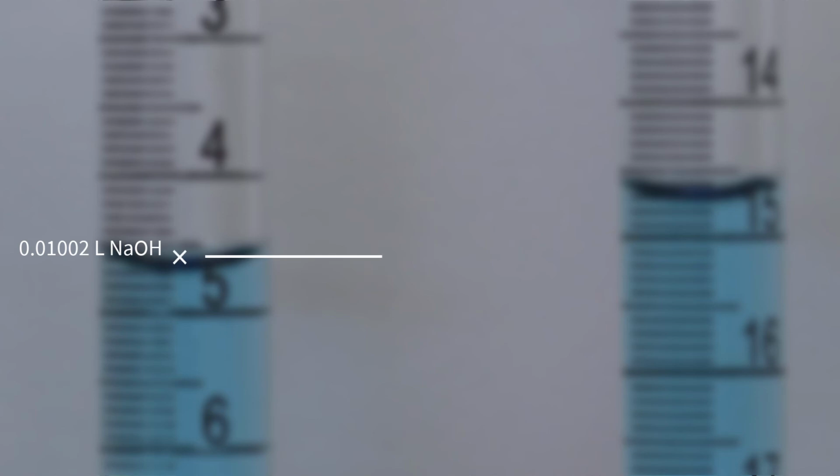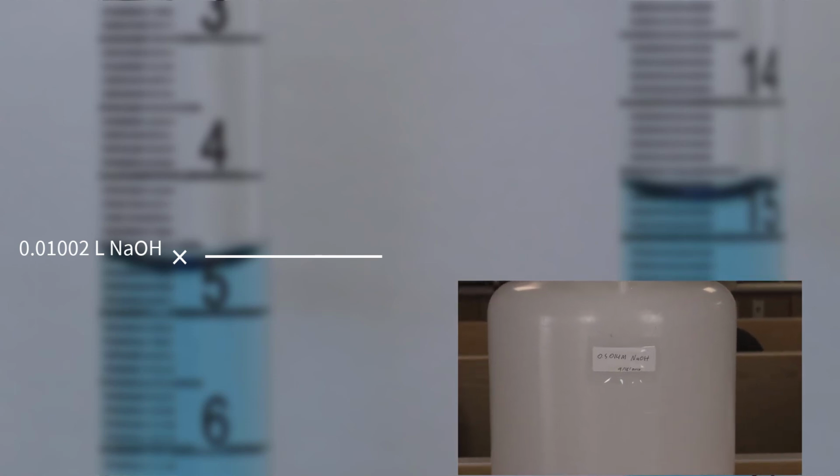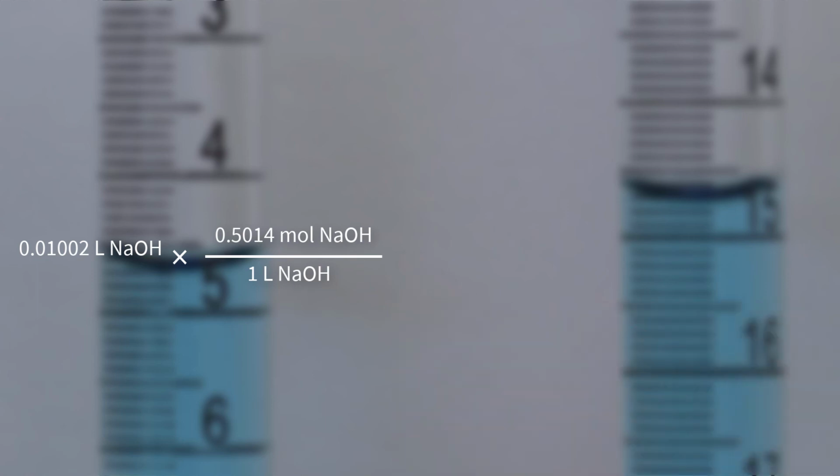We can figure this out by multiplying the volume of the sodium hydroxide in liters by the molarity of the sodium hydroxide. Where do you find the molarity of the sodium hydroxide? It is on the container where you obtain the solution. Make sure that you record this in your lab notebook. In this case, the molarity of the sodium hydroxide is 0.5014. But for your experiment, it may be something different. Let's include this molarity in our calculation. Liters are on the bottom, so that we can cancel out the liters of sodium hydroxide added.